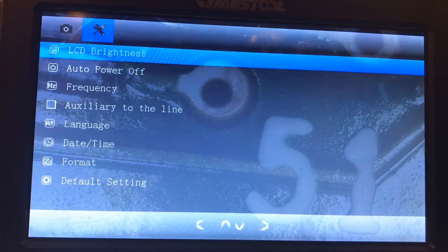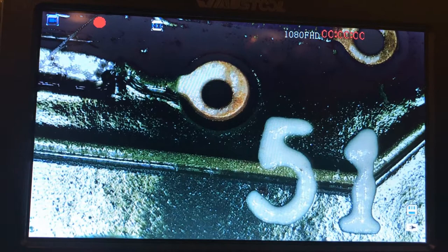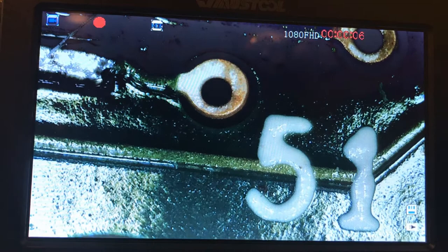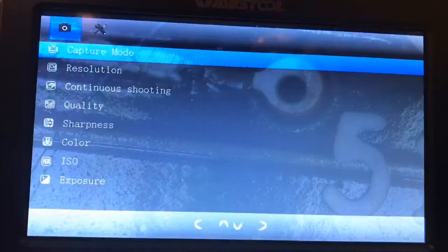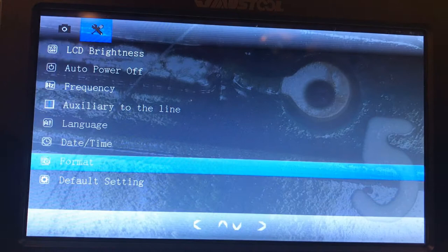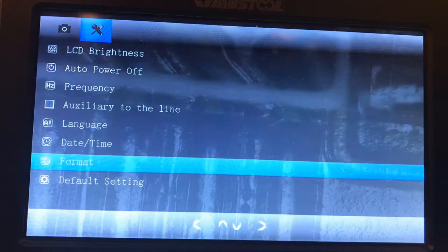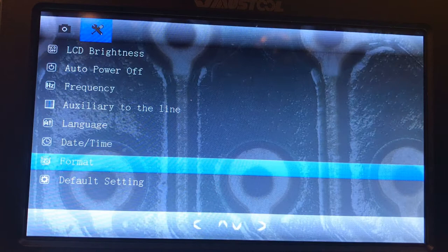You can also hit the D button to view the last picture you took, or switch to video mode and hit OK to record video in 1080p. A lot of people said they had a hard time taking pictures. In the menu under settings, you can format the SD card. Even though I had it formatted to FAT32, letting the device format the SD card allowed it to read and write properly. You can also plug it in via micro USB cable to use as a live webcam, or use it as a memory card reader to grab pictures straight from the computer.